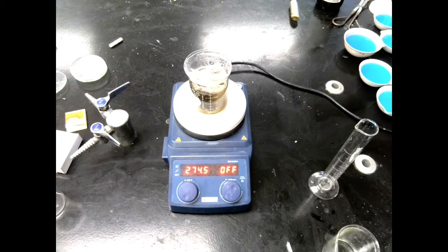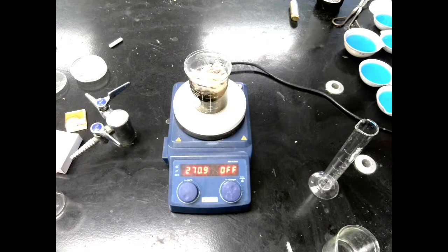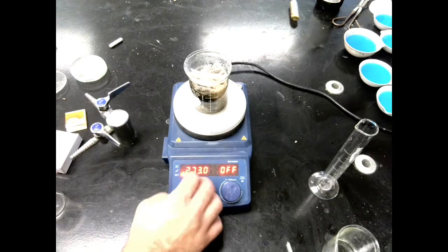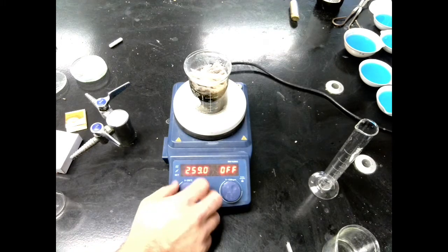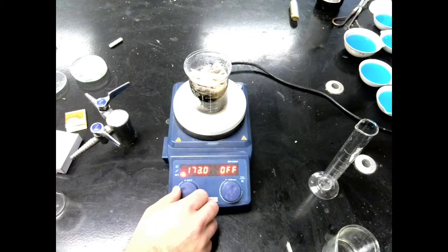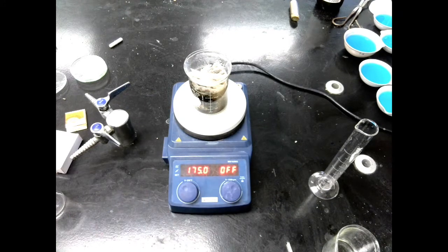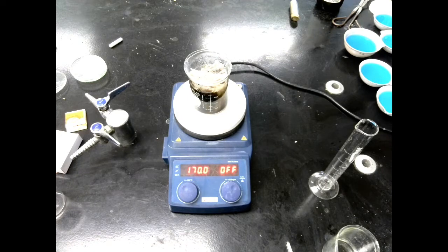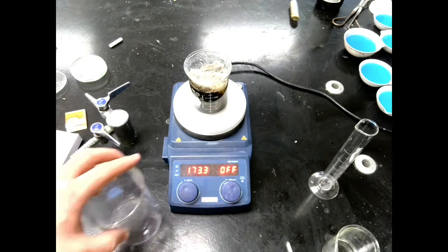Once we do get it to a simmer, we are going to want to turn that heat down. Otherwise, we're just going to start to boil over. So we'll bring it down to about 175. And then we're going to let it simmer like that for about 10 to 15 minutes.